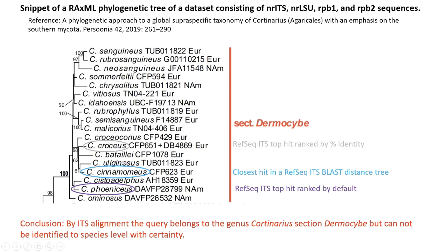They're closely related to each other, and it shows you where these things are in the different things that we looked at. All we can say is that it belongs to this species group probably, but we can't give you a clear species identification for this. And that's just sort of a cautionary tale of the kinds of things you're going to run into with using BLAST as a tool, and the fact that we have a limited taxonomic coverage for these organisms.